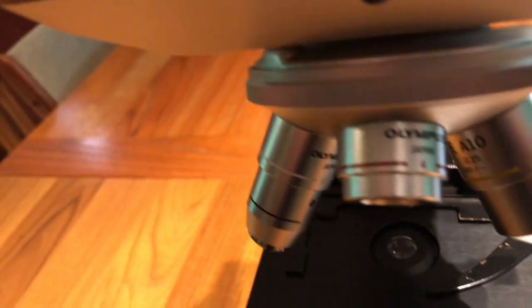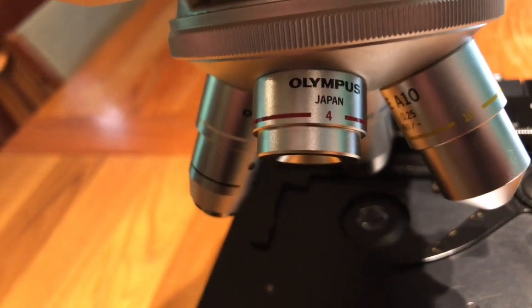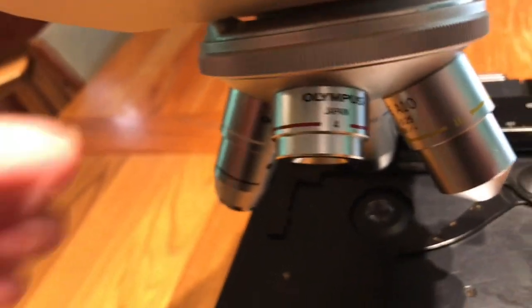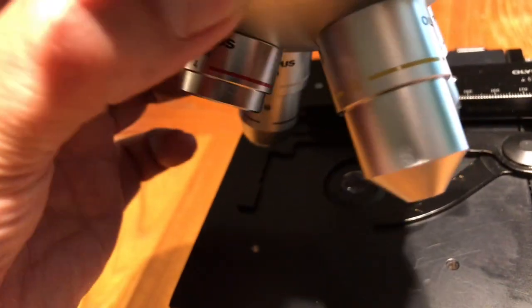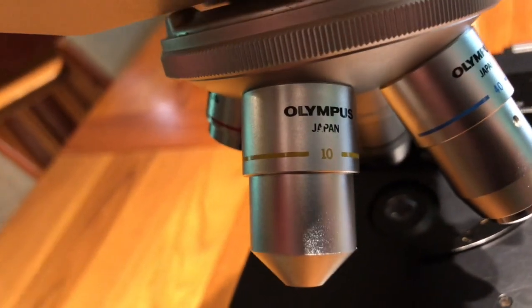Here is our smallest objective, and the 4 with the red band indicates that that is a magnification of 4x. And then if we go to the yellow one which is bigger, that's a magnification of 10x.